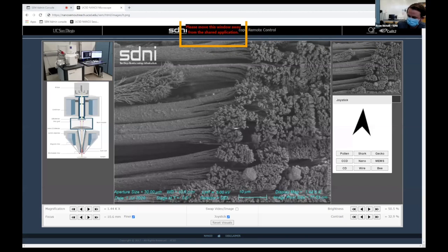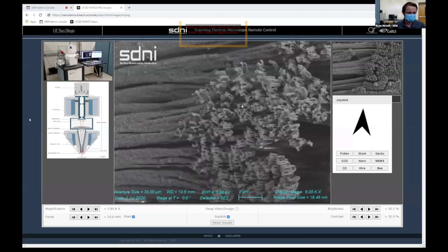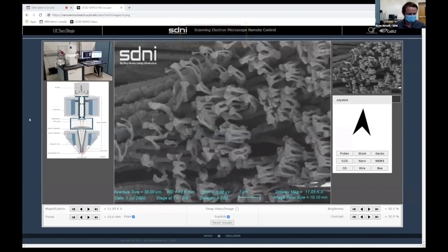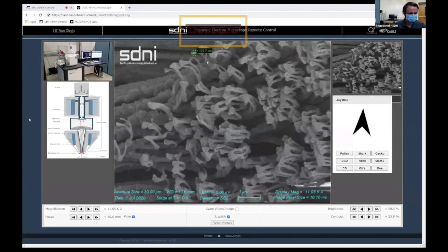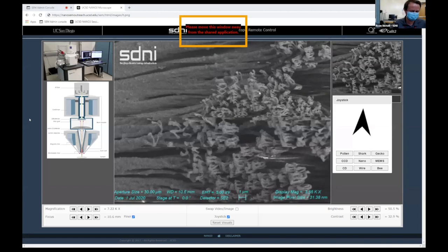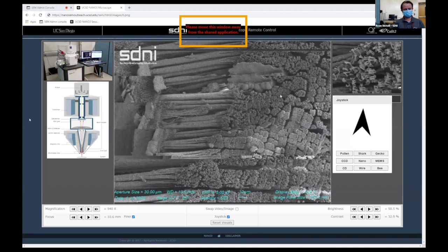All right, so yeah, we're on the gecko foot. I recognize the image, looking good. The thing that's spectacular that I always have to point out is this. If you go into the very end where all of the hairs bifurcate and then they break off, you're talking about sizes that are 100 nanometers from a natural sort of living organism. These little pads, which, anyway, sorry. That's what I teach the kids. Getting excited. No, keep going.